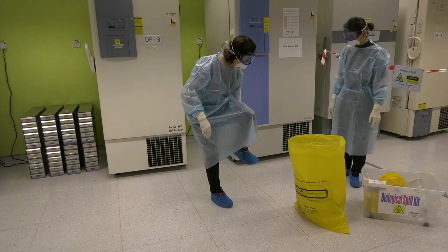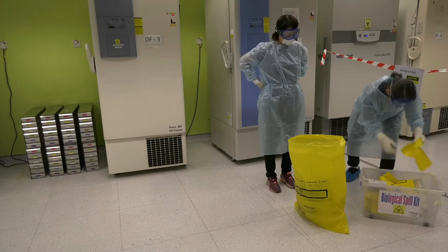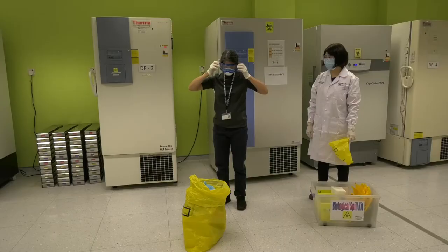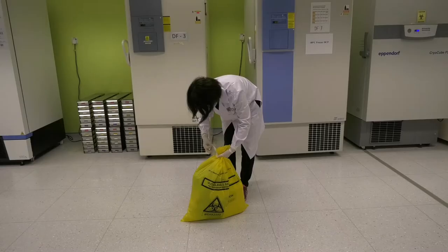Doffing of PPE — last in, first out rule. Shoe covers. Gloves outer layer. Disposable lab coat — inside out gently. Eye protection. N95 respirator handled by straps. Inner gloves. Put on a new pair of gloves to assist your body in doffing off PPE.